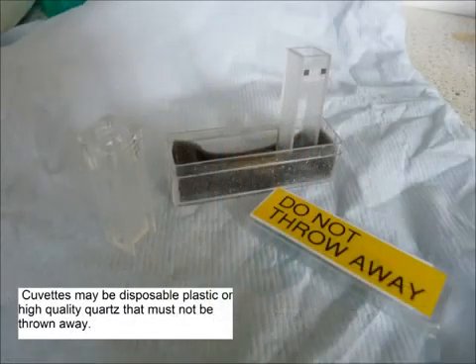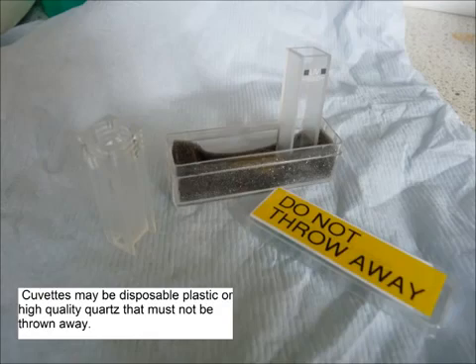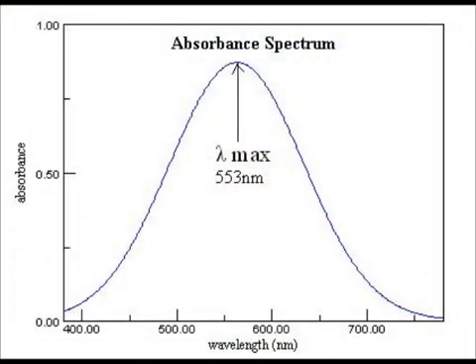Spectroscopy uses monochromatic light. This is selected by choosing LambdaMax. LambdaMax is identified as the wavelength of maximum absorption for the sample under analysis and is characteristic for each compound. The use of LambdaMax provides the highest sensitivity and minimizes deviations from Beer-Lambert law.